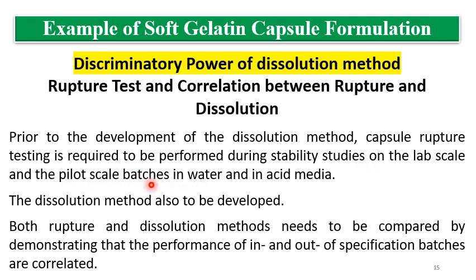The pilot scale batches means the BE batches, in the water and in the acid media. So here the dissolution media selected is the acid media. So two media can be taken for rupture time determination. The dissolution method also is to be developed, because the rupture time will not always give the exact picture of the dissolution. That's why the dissolution method is also required to be developed.